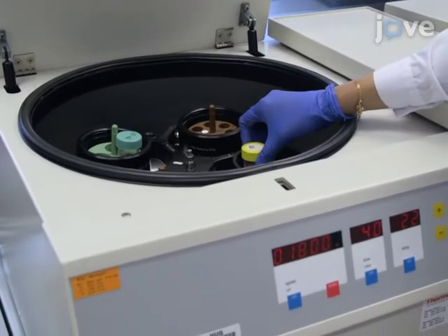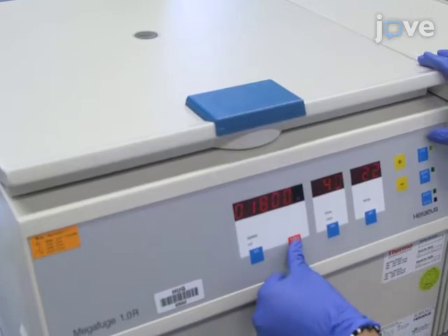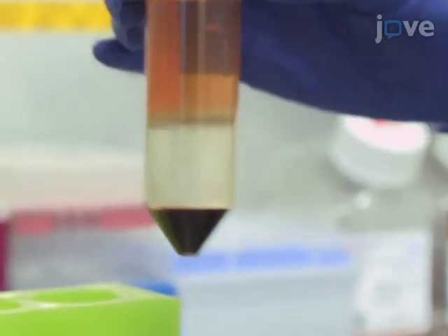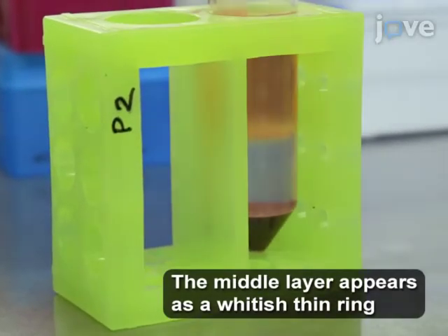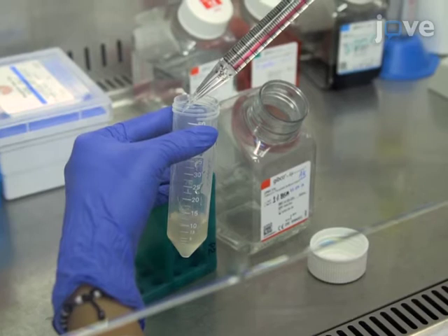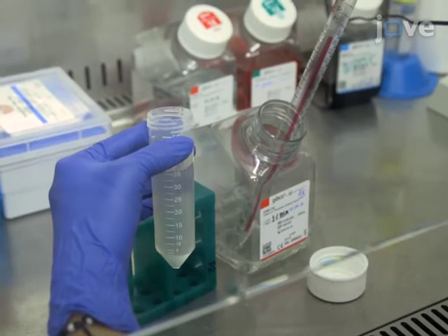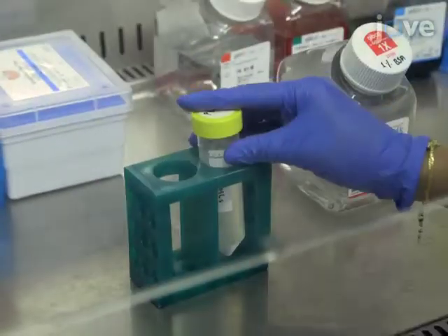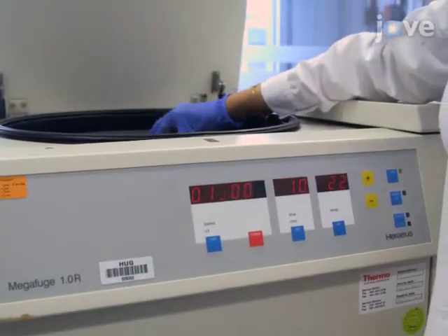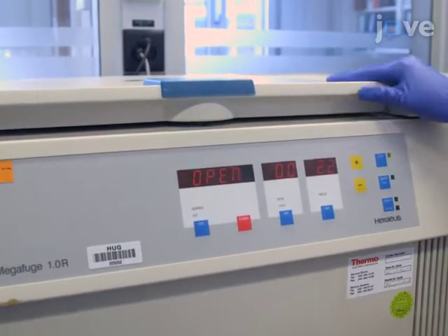Then, turn the brakes off and centrifuge the blood sample at 400 G for 40 minutes at room temperature. Use a sterile Pasteur pipette to aspirate the mononuclear blood cells from the middle layer and transfer in a clean tube. To wash the mononuclear cells, add 3 volumes of sterile single-strength phosphate buffered saline with 1% fetal bovine serum to an estimated volume of cell suspension. Pipette the cell suspension several times for proper mixing. Then, centrifuge the sample at 400 to 500 G for 10 to 15 minutes at room temperature.